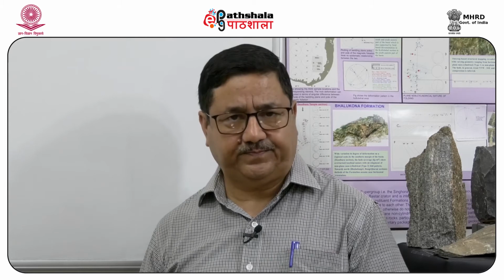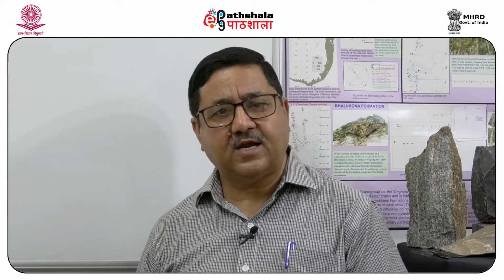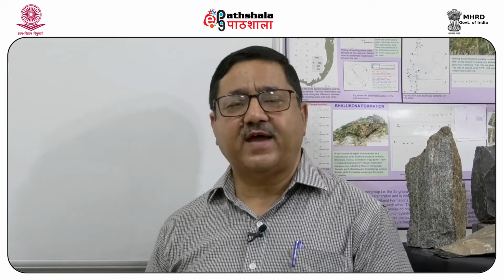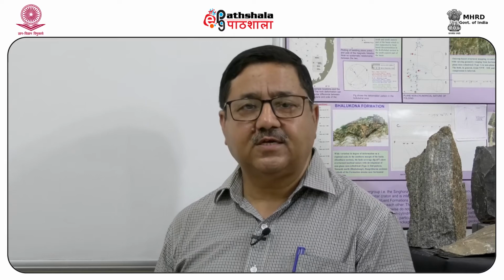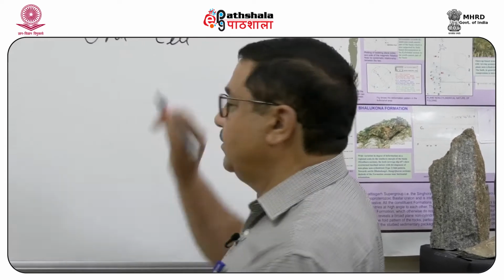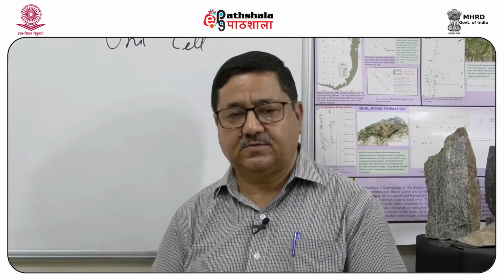Let us first understand what is a crystalline material, or what are the special attributes of a crystalline material. A crystalline material can be considered as a regular ordered internal atomic arrangement, which can be produced by, within quote, infinite repetition of a unit. That unit is known as the unit cell. We say infinite repetition because the unit cell is very small, in terms of angstroms.